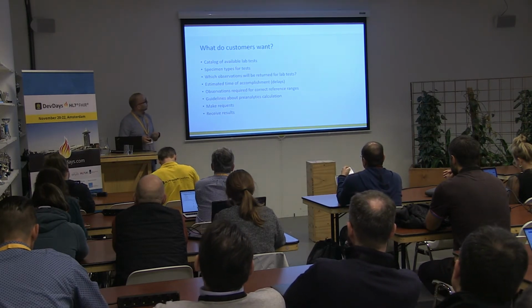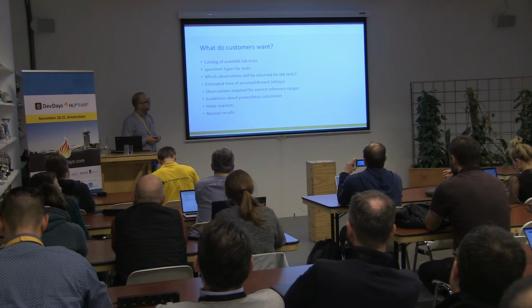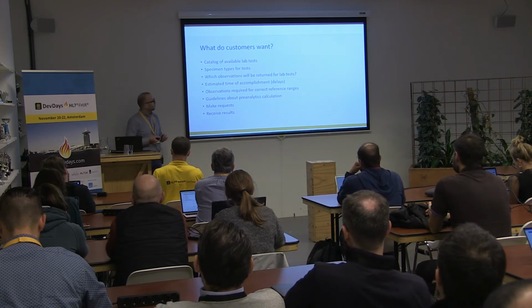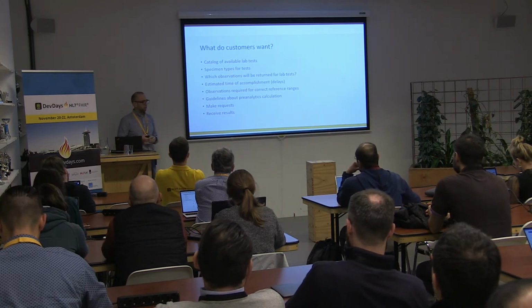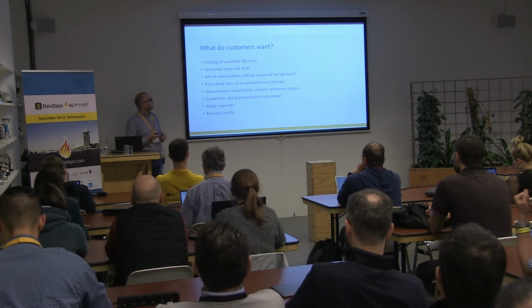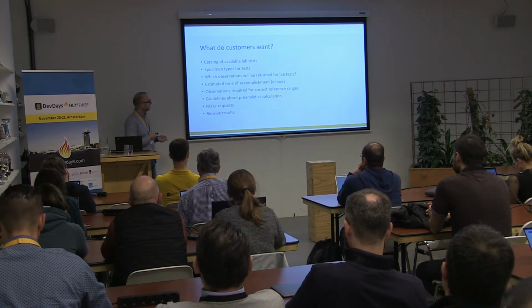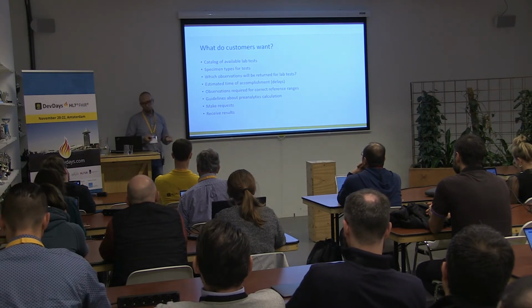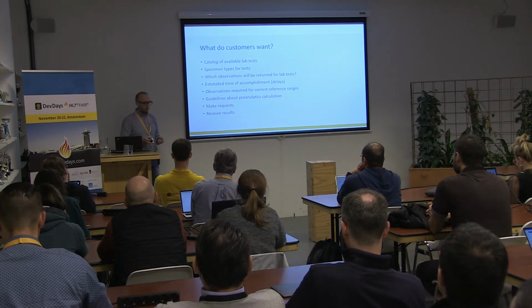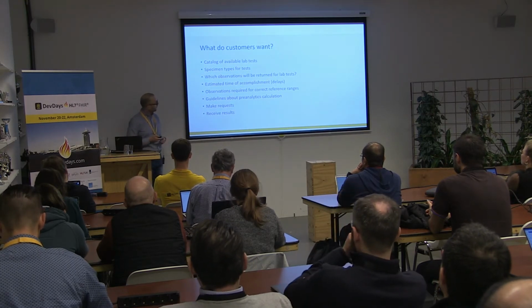Also, they would like to know which types of specimen are available and which types of containers can be used. They would like to know which type of observation will be returned to them, and also how long it will take to make a test or a lot of tests. Some information on how specimen should be handled, and we call this pre-analytics, and how requests can be sent to the laboratory and results received. Let's have a look at FHIR resources which can be used to fulfill these requirements.